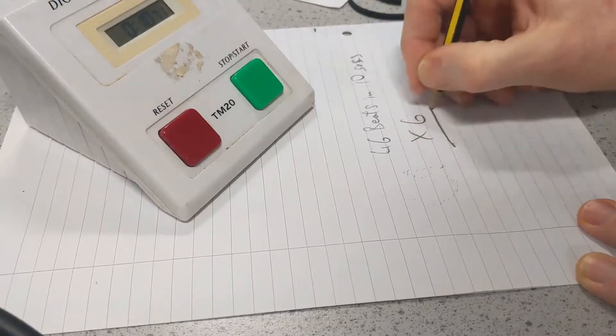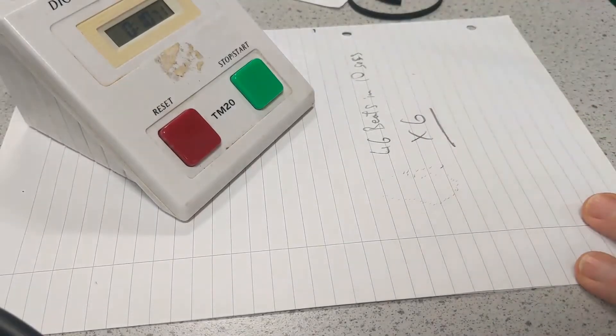Then you multiply this by 6 to give you your heart rate per minute.